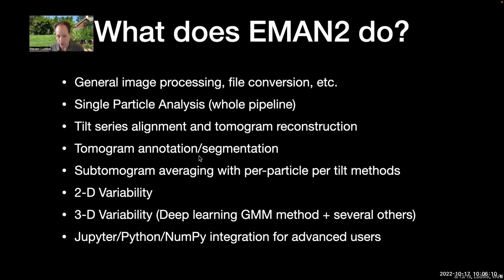We have a deep learning based tool for tomogram annotation and segmentation. We're continuing to develop those tools. That's part of Land's thesis now, actually, developing some improved tools for doing this.